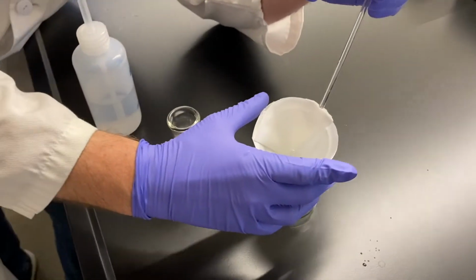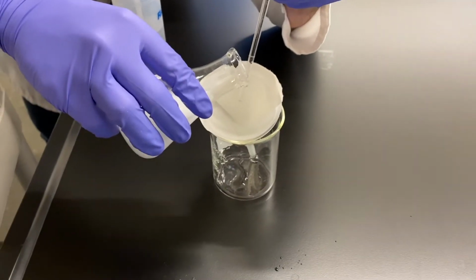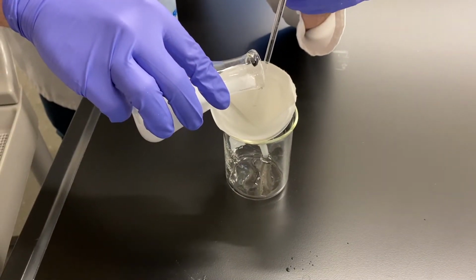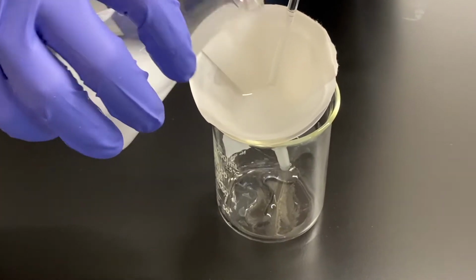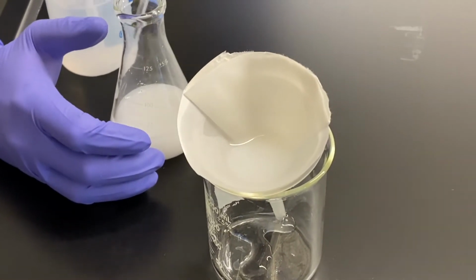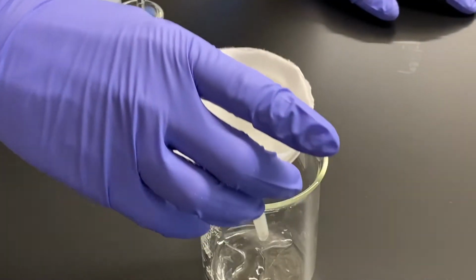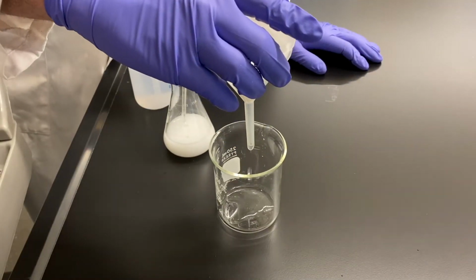And this filtering can take some time also because you don't want to add it too fast. It can splash, it can spill, you can overflow it. And because we have the flow rate slower, so none of the calcium carbonate or sand goes through, it is also going to make it take longer. But even though it takes longer, it'll give us better data and results, which is what we care about more.